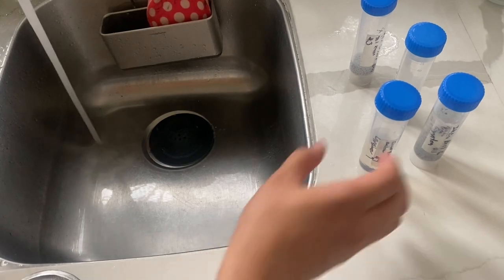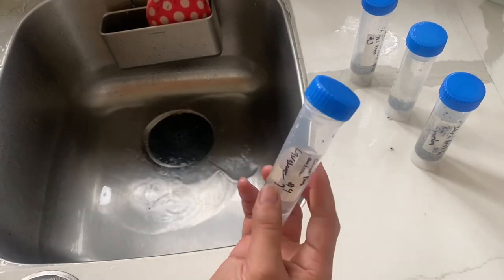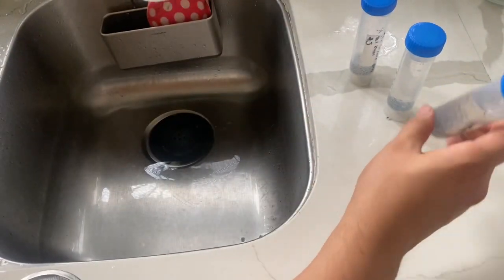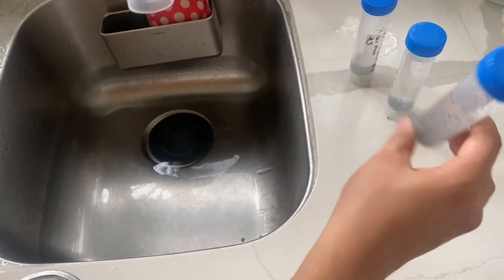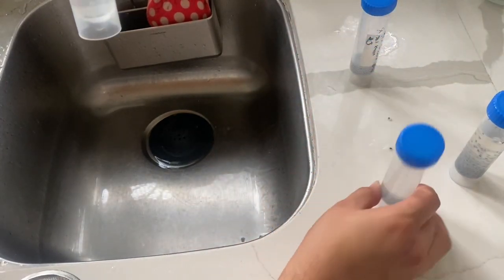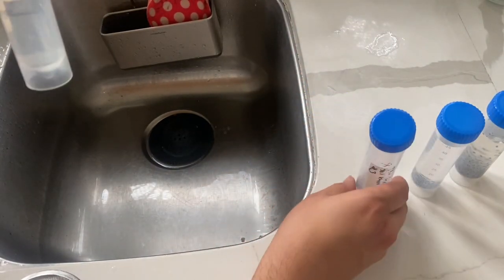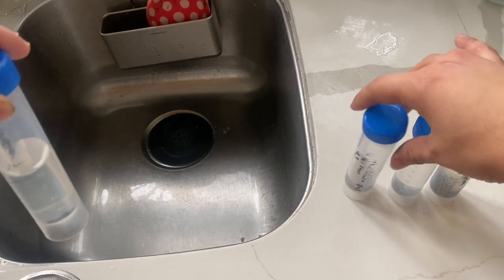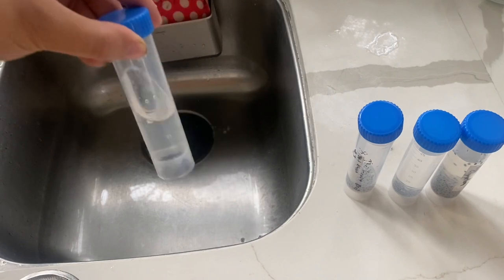But to start off with, I was soaking these seeds for about 6 hours so they can hydrate. You can see they've all sunk. For the most part, they've sunk to the bottom, showing that they are hydrated in order to germinate in tissue culture. Basil is very easy to germinate in tissue culture from seed, and lavender is pretty easy as well.